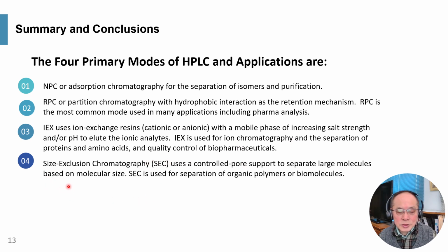Finally, size exclusion chromatography using a controlled pore support to separate large molecules based on molecular size. SEC is used in separation of organic polymers or biomolecules.